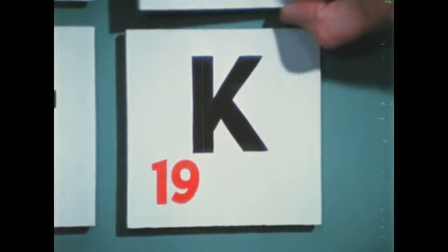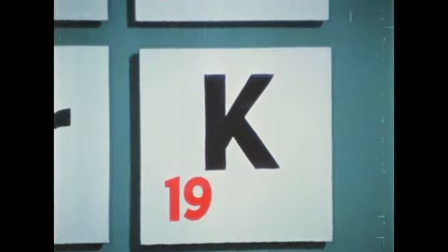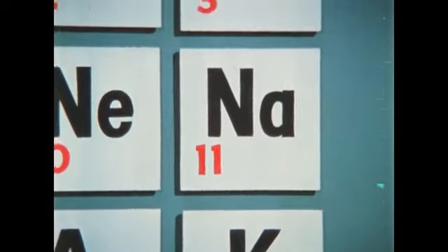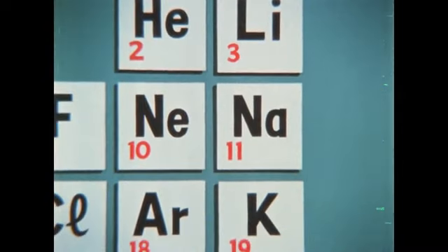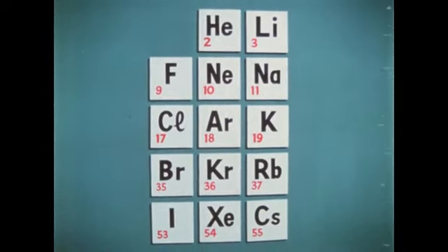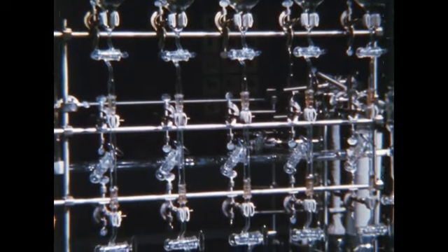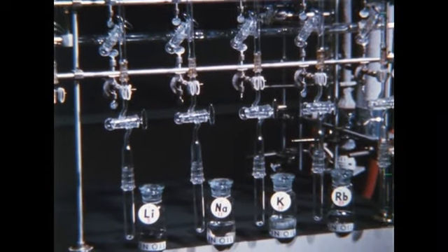We have already done a good many reactions with potassium. Perhaps there are other elements of similar chemistry. Let's consider the elements which have one more electron than an inert gas. They are lithium, sodium, potassium, rubidium, and cesium. Let's study their reactions, for example, with chlorine. The gas bulbs are now filled with chlorine and pieces of the 5 metals placed in the reaction tubes below.